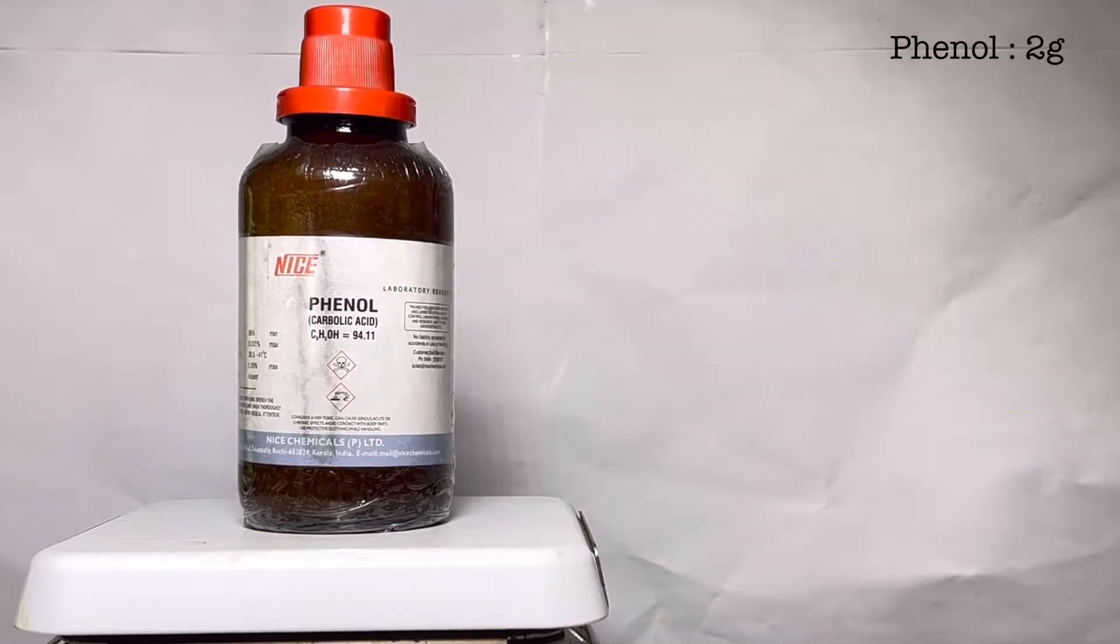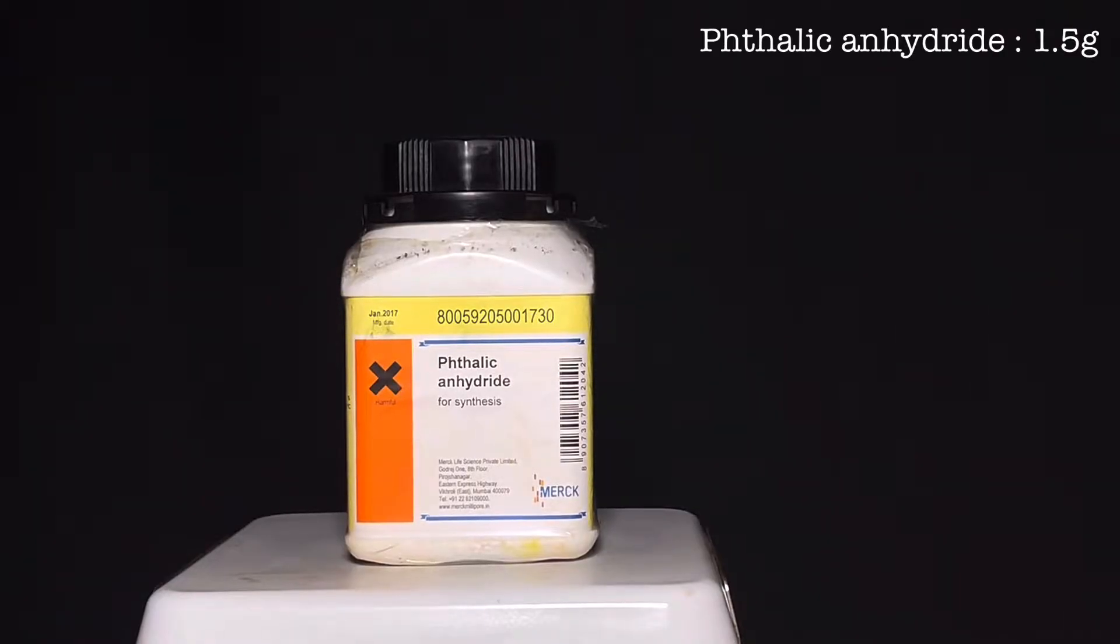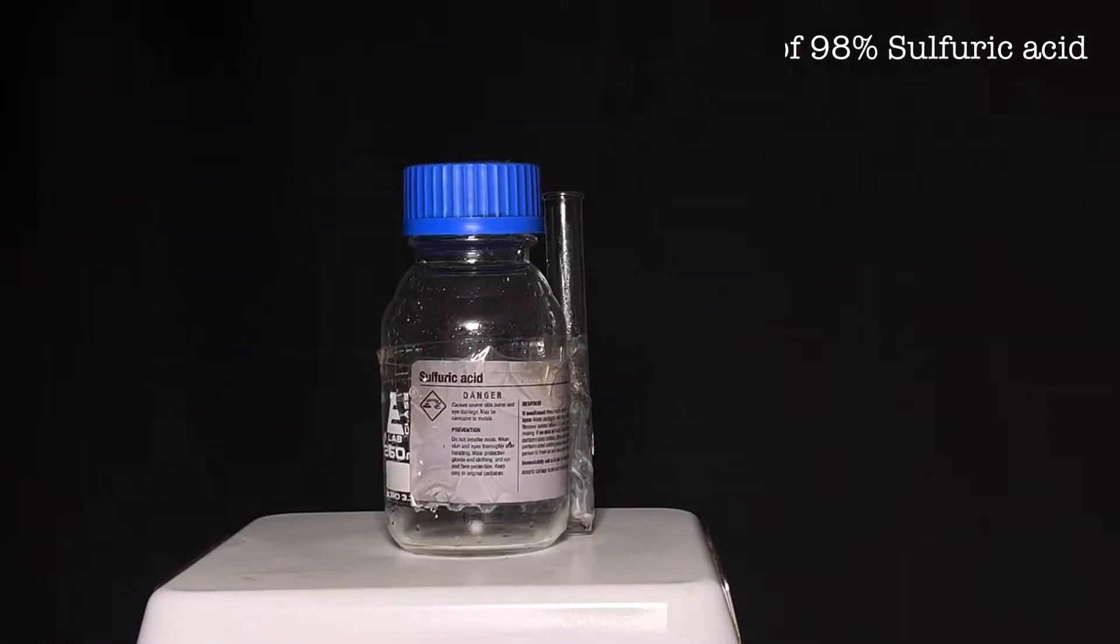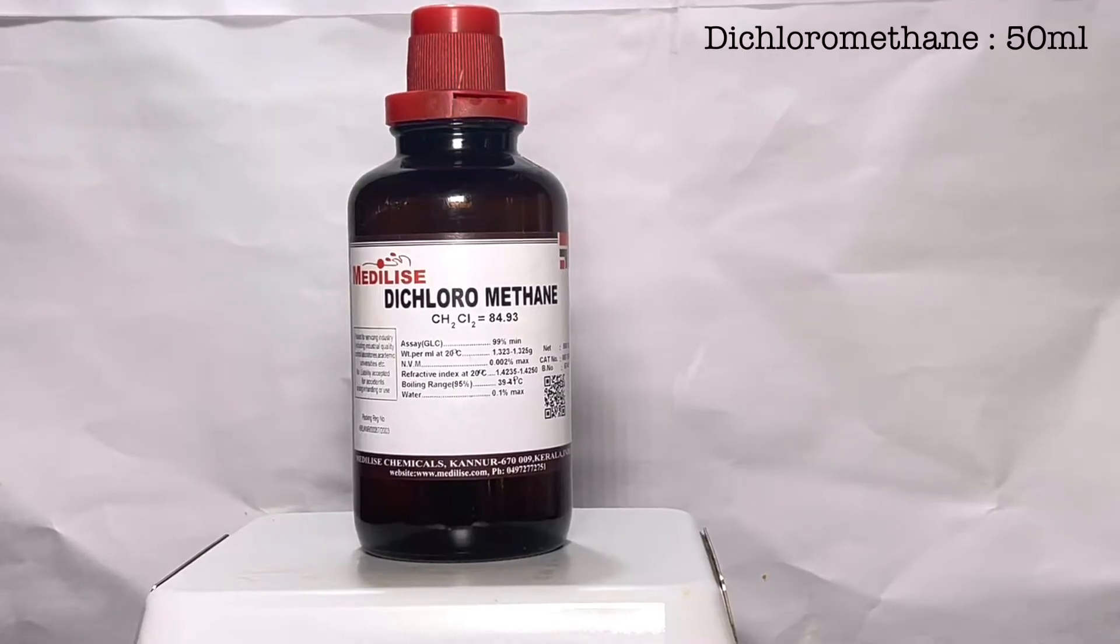For this synthesis we will need 2 grams of phenol, 1.5 grams of phthalic anhydride, few drops of 98% sulfuric acid, and 50 ml of DCM or dichloromethane for extraction.